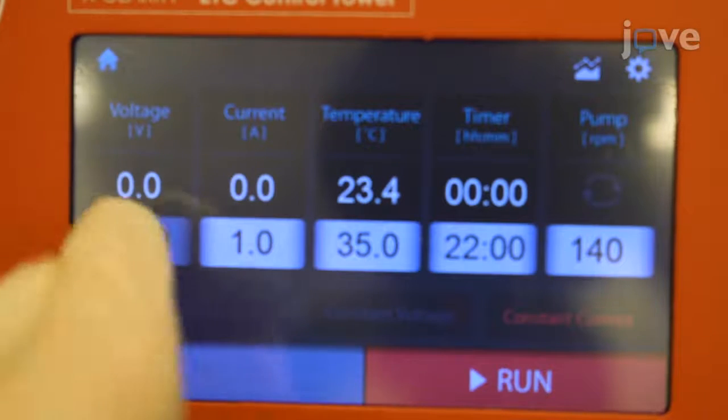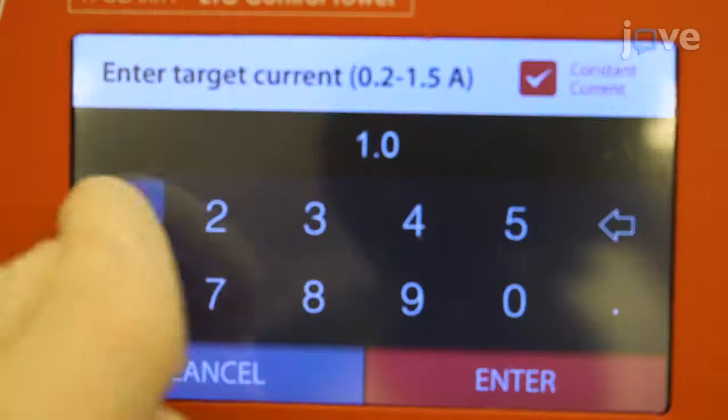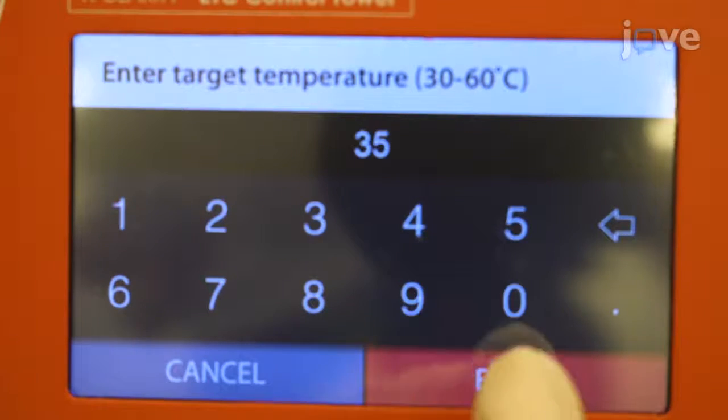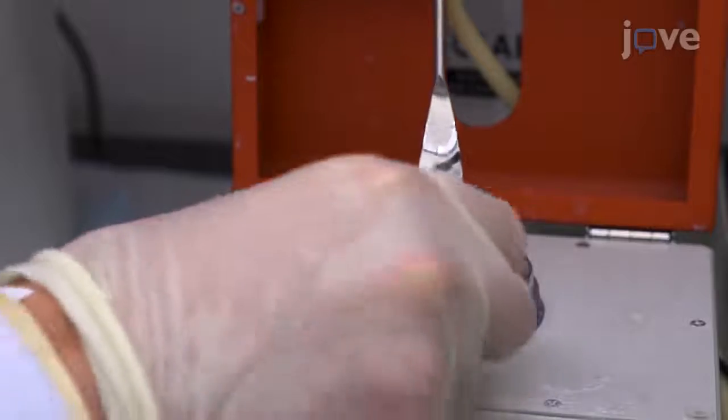Run the sample at 70 volts, 1 ampere, and 35 degrees Celsius with constant current for about 2 hours per milliliter of tissue.